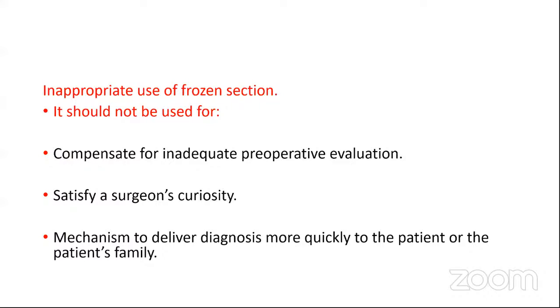However, frozen section could be misused sometimes, and we have to make sure that we educate our colleagues that we are doing the frozen section under appropriate indications. Sometimes the inappropriate use of a frozen section is to compensate for inadequate preoperative evaluation.